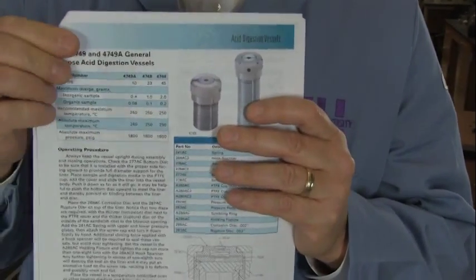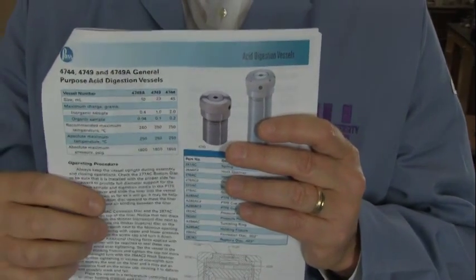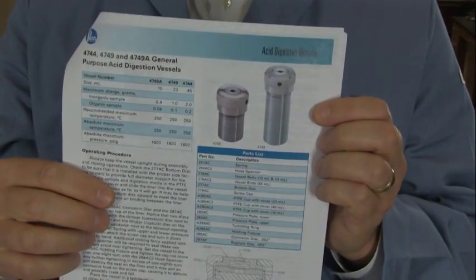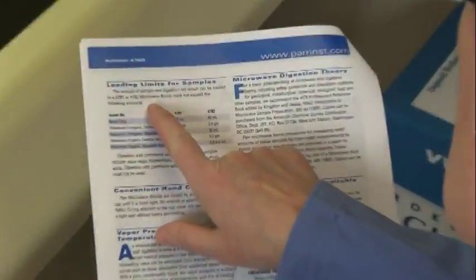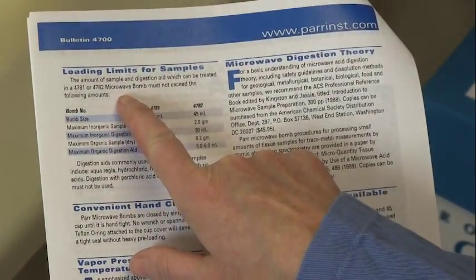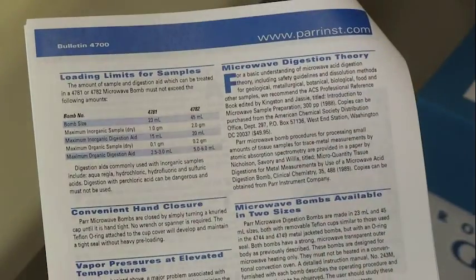Familiarize yourself with the maximum temperature and working pressure for the vessel you are using. Where available, identify the charging limits for each chemical and vessel size in the manufacturer's literature.